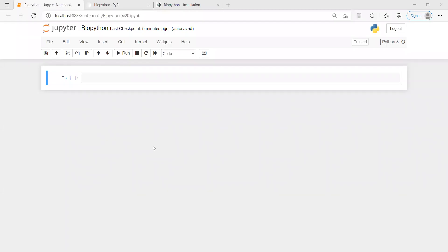Hello, welcome back. In this particular video, we are going to see BioPython — how to do the installation part and then run a simple example using Jupyter Notebook.